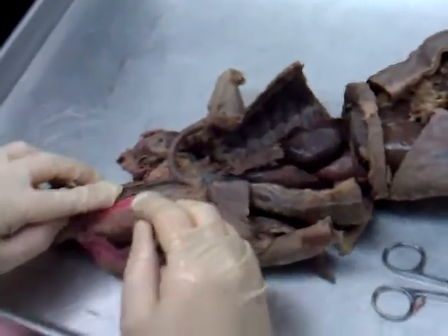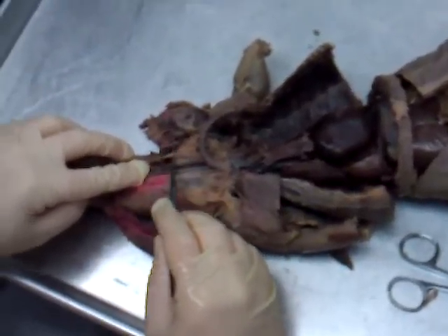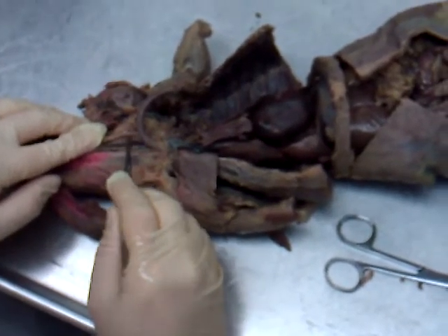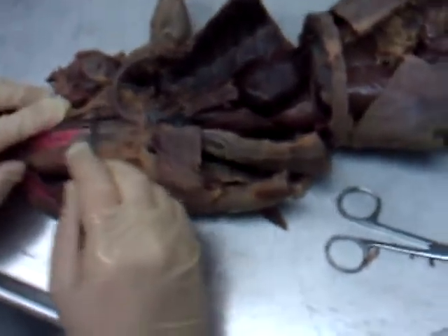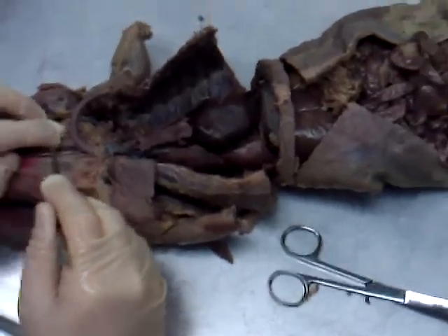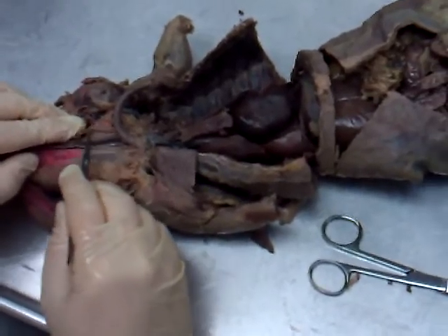On either side of the trachea and the esophagus we have some blood vessels and a nerve — a neurovascular bundle. Most minks show the artery and nerve; very few show the vein. The nerve is the vagus nerve. This would be the left vagus nerve.